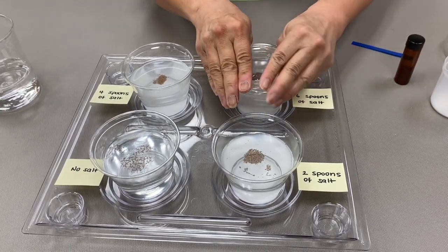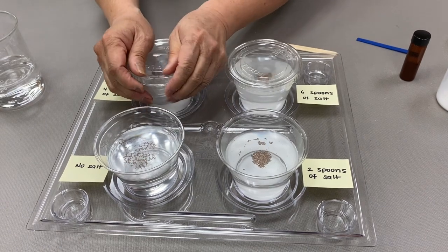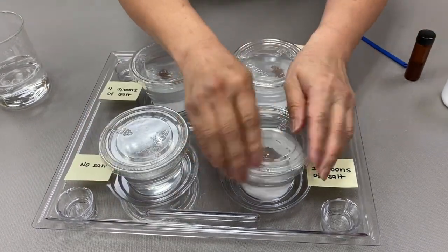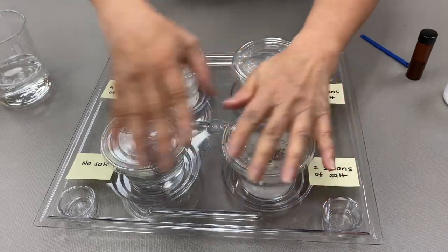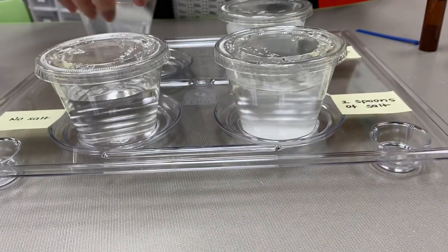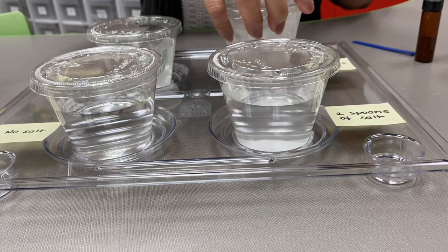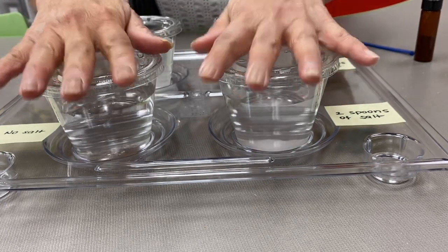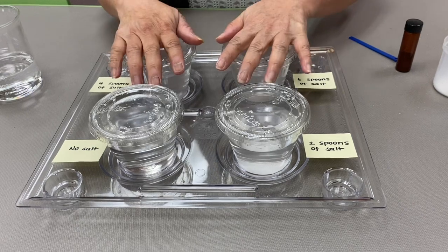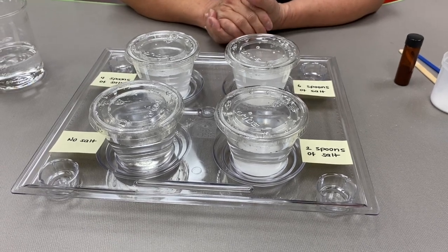I'll go ahead and put covers on each and shake them up a little bit to get all of the eggs wet. Then we'll check on them in a couple of days — it takes about 24 to 48 hours for them to hatch — and we'll see if the different levels of salinity made a difference in the eggs being able to hatch.